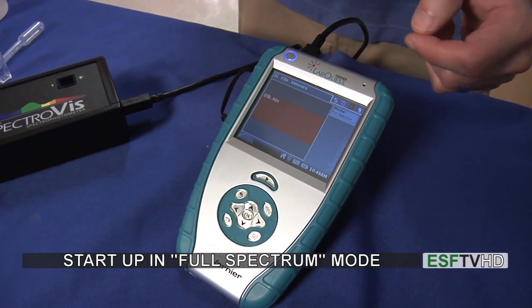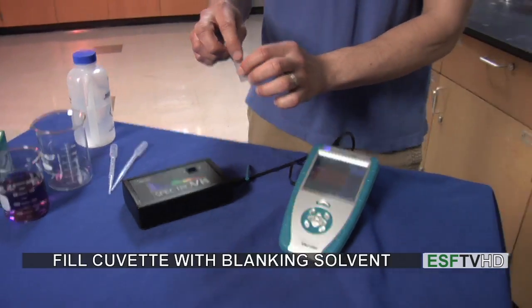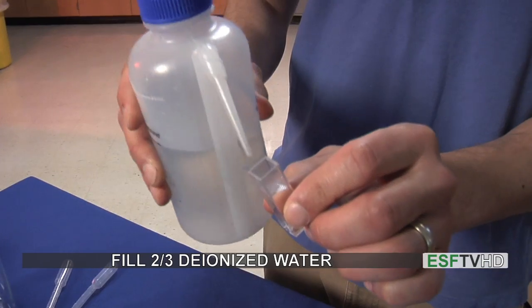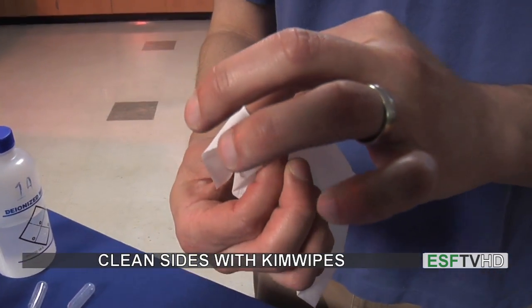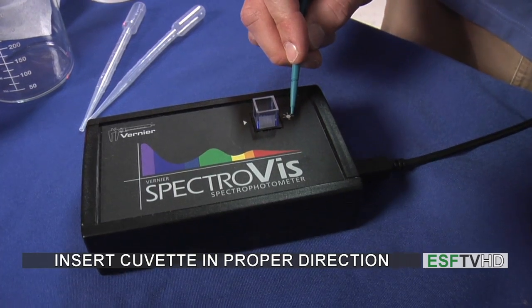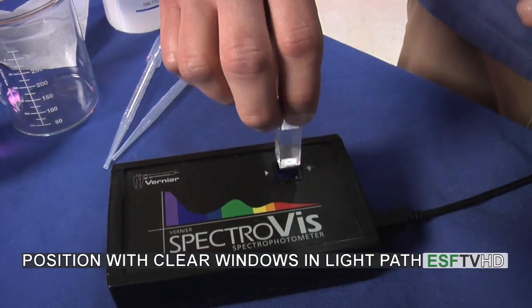With any spectroscopy experiment, we always need to acquire a blank spectrum. To do that, I'm going to fill my cuvette with my blanking solvent — in this case, deionized water. I'm going to fill that cuvette until it's about two-thirds full with water, clean the sides of the cuvette with a kimwipe, and then insert it into the spectrometer. The spectrometer's light path goes from the light bulb to the sensor, so I have to make sure that the clear windows of the cuvette are facing in that direction.